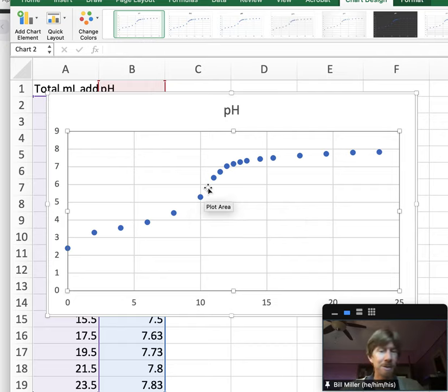For your graph, you're going to put a nice title: milliliters of sodium carbonate solution down here on the x-axis, pH on the y-axis, and then this graph will be good to turn in. Now I'm going to do my second trial from about 9.9 milliliters out to about 12 milliliters. I'm going to do half milliliters next time.